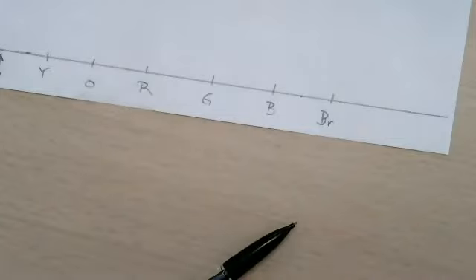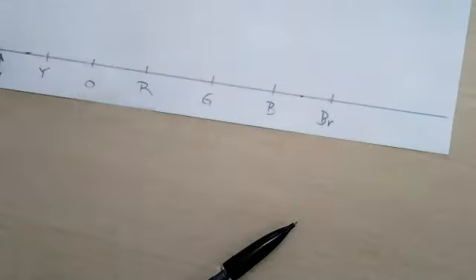All right, and what you'll do, I know we all think the more the better, or the bigger the better. Not so. We just need a small, concentrated enough sample to start. So capillary action, that's why we call these capillary tubes. You don't have to do anything other than touch the capillary tube to the solution.